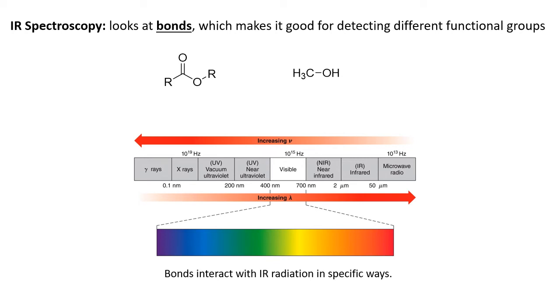In this video, we will be going over the basics of IR spectroscopy. Now, please keep in mind that we will go into more depth of this topic in Chem 227, but this will provide you with enough information that will allow you to analyze your products that you make in lab for the rest of the semester.